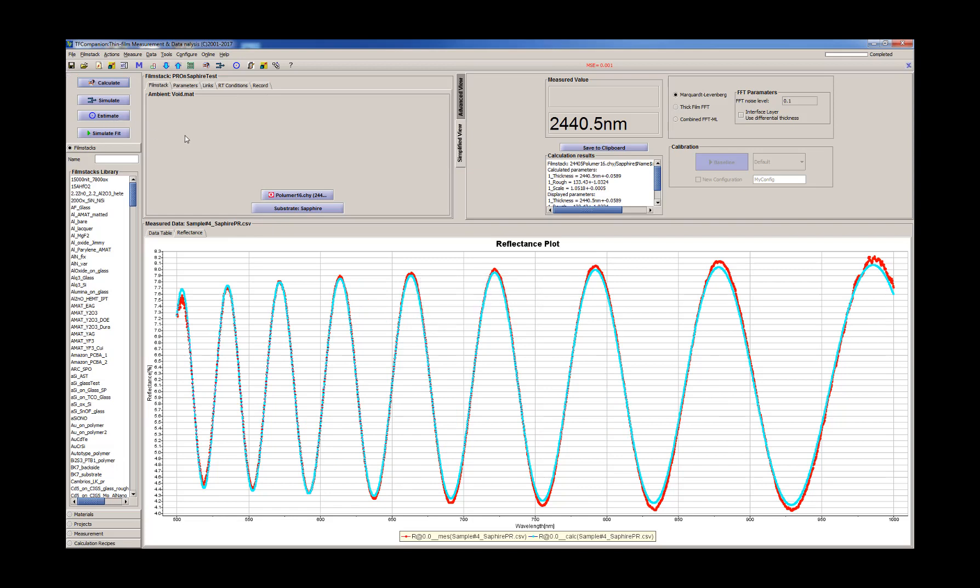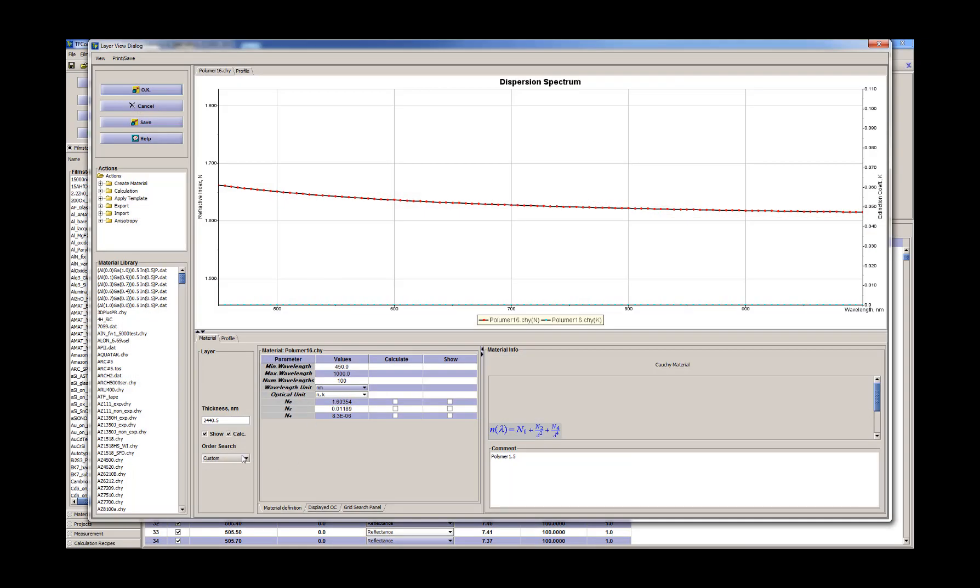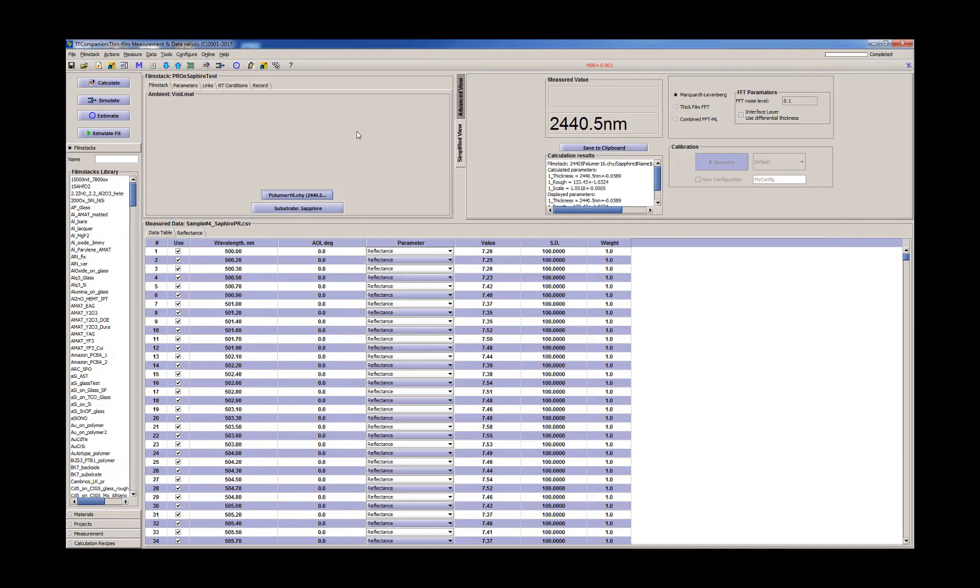So it takes some time because software needs to calculate solution for different starting points. So it's a little bit slower.